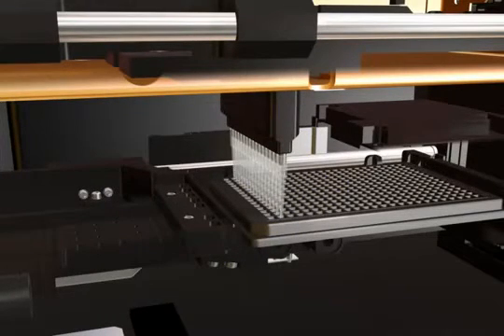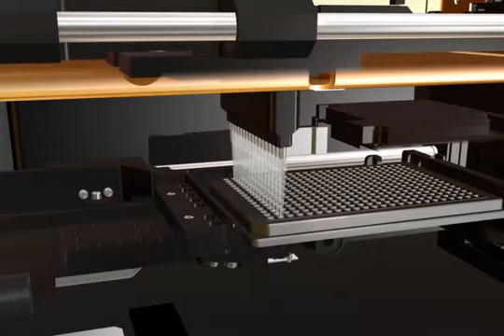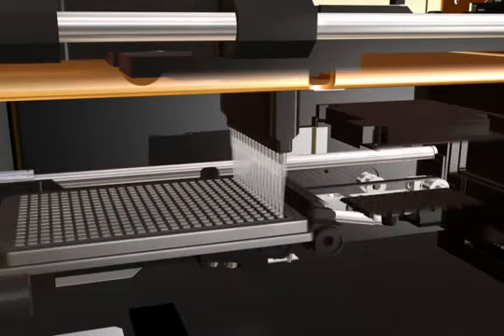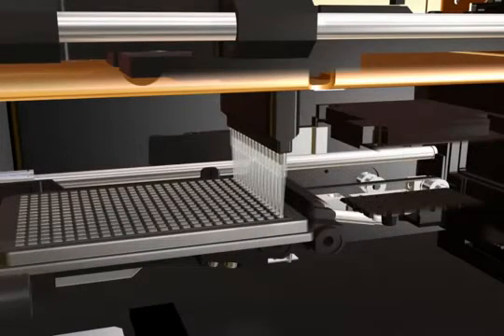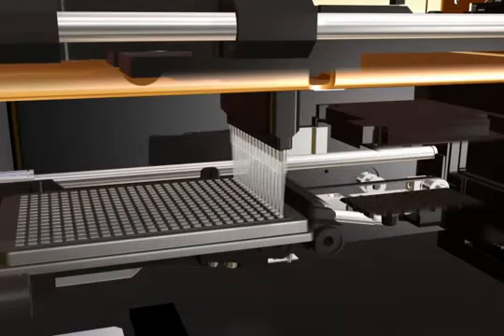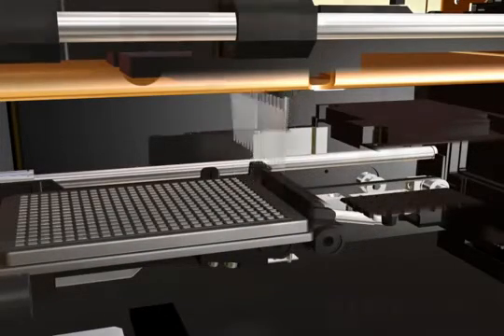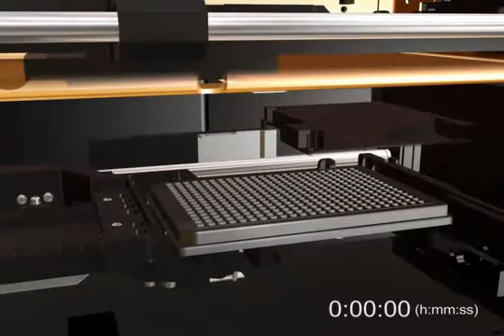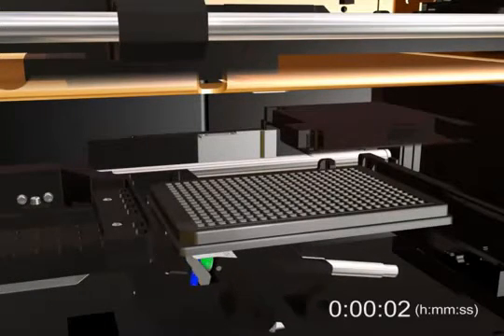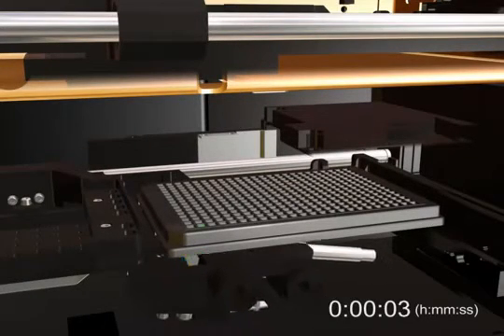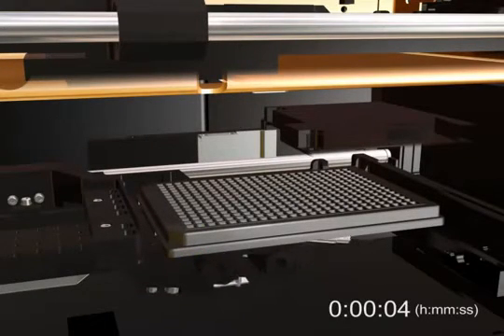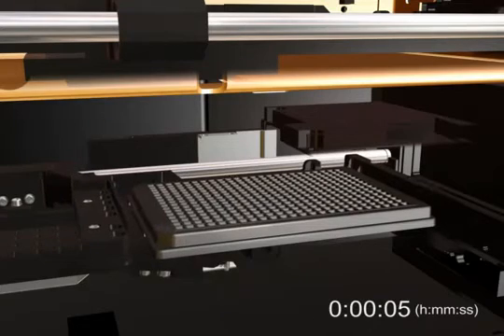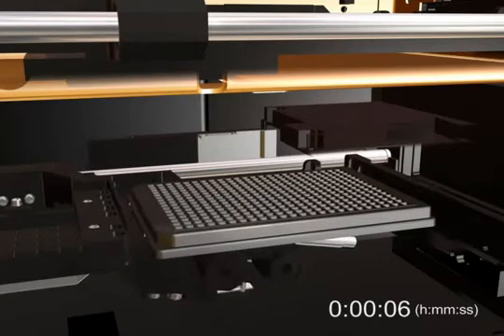Here the instrument is pipetting reagents into a 384 well plate using the 16-channel pipetter head. The FlexStation pipetter has now finished pipetting reagents into the plate and is ready to take the first reading.